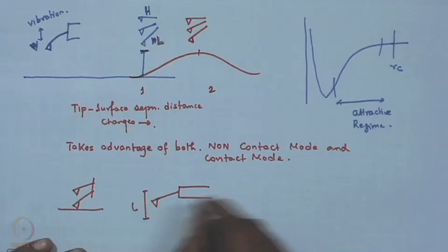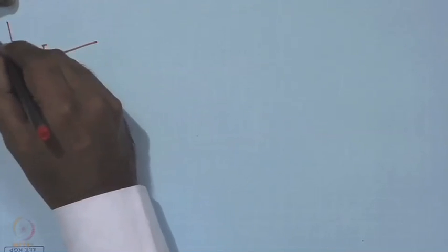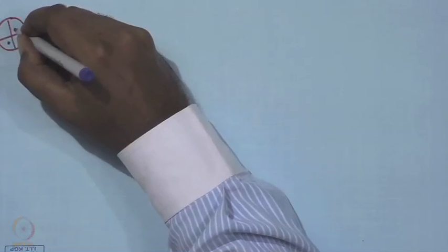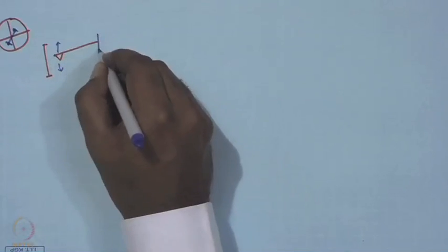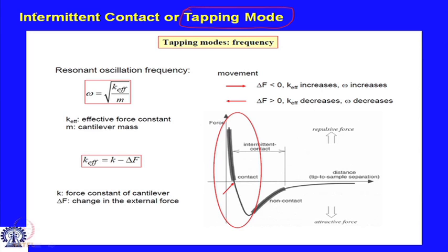Correspondingly on the QPD, the laser spot travels continuously between these two limits. Okay. So, this is the free amplitude of the cantilever you have given. The frequency that is chosen for oscillation is the resonant frequency. We all know what is resonant frequency.